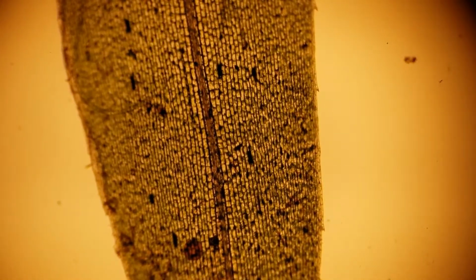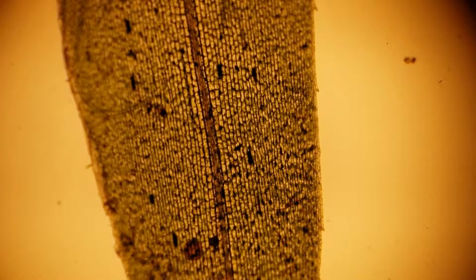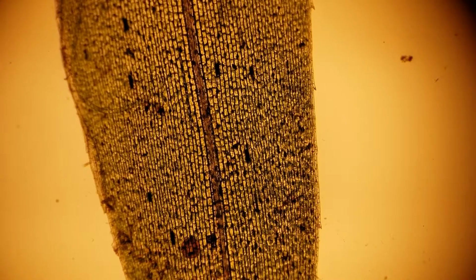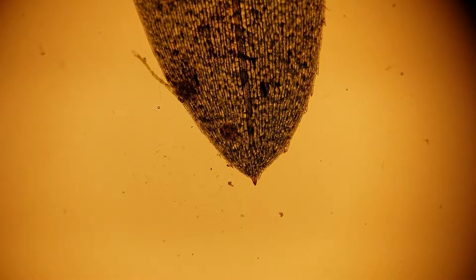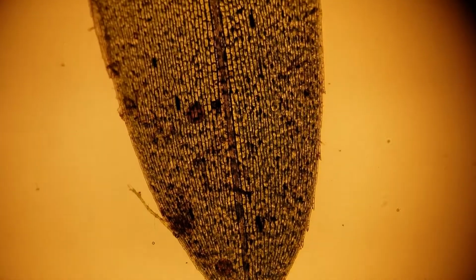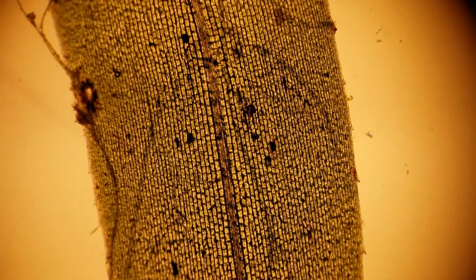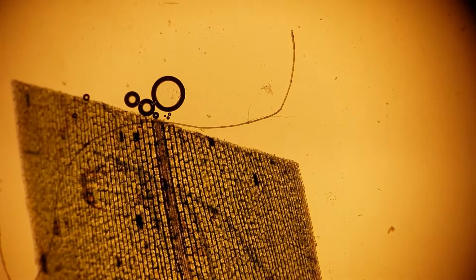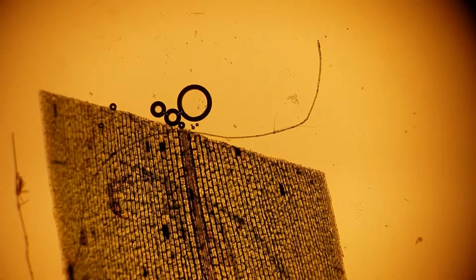We can distinctly see the cells and the cell walls. Plant cells are usually rectangular. A lot of interesting variation in there. Here's the tip. This is a flat leaf. And then the spot where I cut it with the scissors. And a few air bubbles there.